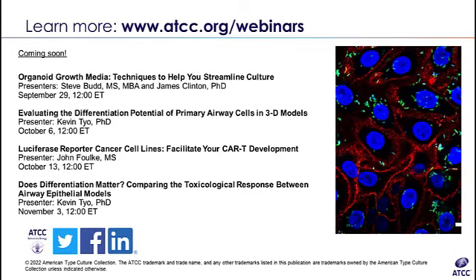So you have a pretty good window there. If you want to freeze your cells down, say, early in the morning, you can put them in there for 4 hours or so, and then later in the afternoon put them in the liquid nitrogen. Or if you want to freeze them down later in the day, you can certainly put it in the minus 80 overnight. But we recommend no longer than 24 hours in the minus 80. Okay, yeah, that makes sense, or else you're going to risk cell damage, right?